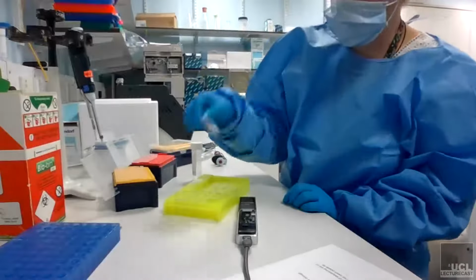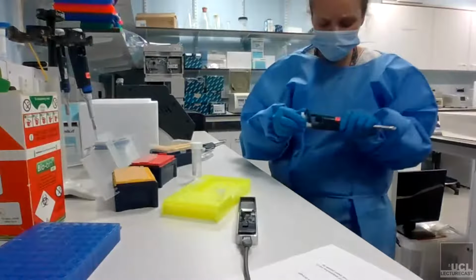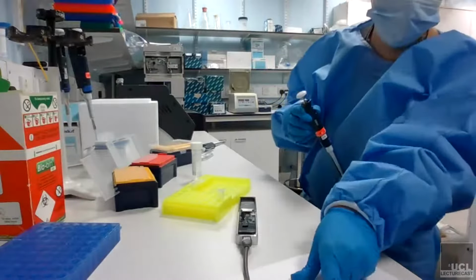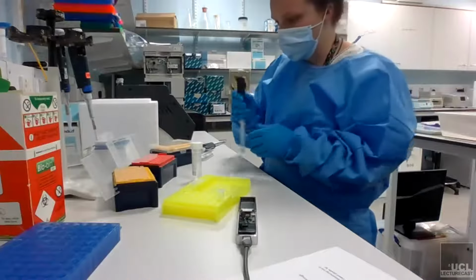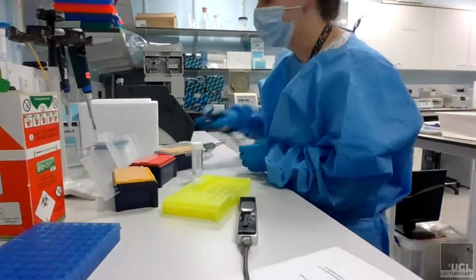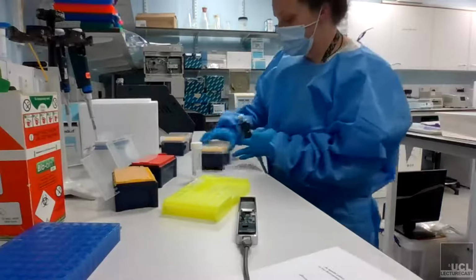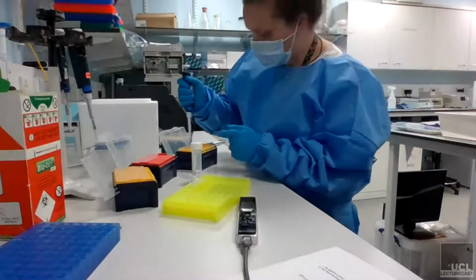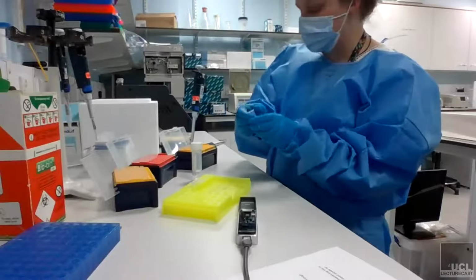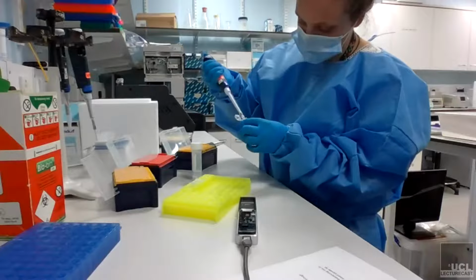Now all we need to do is add our sample. As I say, this is usually about 75 microliters. The complete amount of the library is about 75 microliters, I think. Again, just make sure that you mix the tube so the beads are fairly evenly distributed, and then suck up your sample.